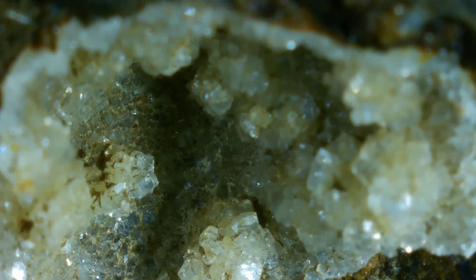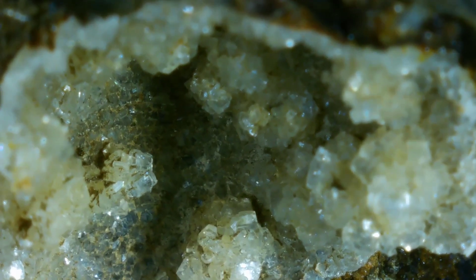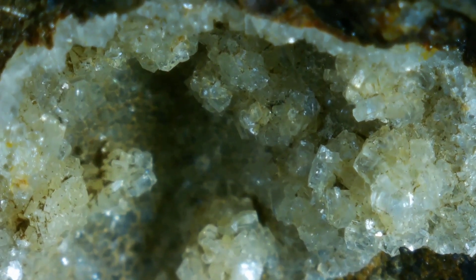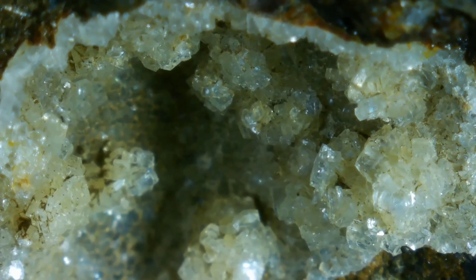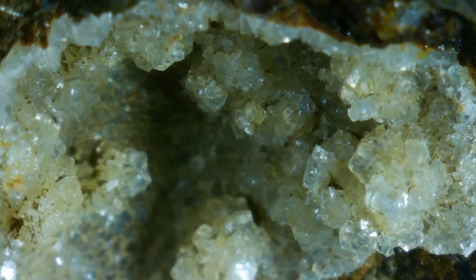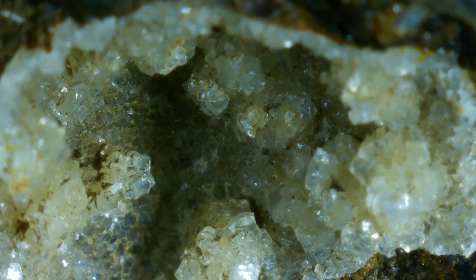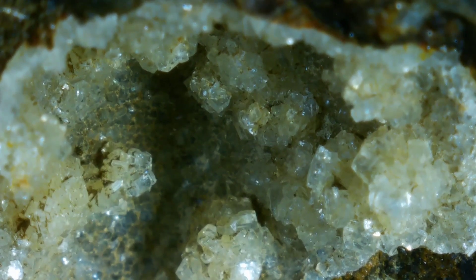I can move my lights around, get it where I need it, aim some lights in here, focus — and I can start to see the structure of these minerals. The pocket closest to the surface is out of focus and the stuff deeper in is in focus, and we can move that around to see what's happening. What we have here is a decent amount of chabazite, and it looks like in the background we have a bedding of phillipsite. I can clearly see what we have, which makes me very happy. Had I had this before, I could absolutely plug this in at a collecting area and check small rocks under it.